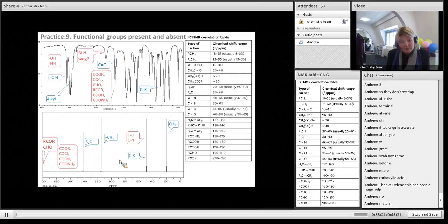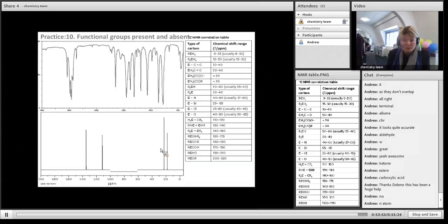In this particular case, actually, and you wouldn't see it without the mass spec, we have a halogen here. So there's actually a halogen in this particular one, which you wouldn't have known very much from the IR. You can see all these peaks here, so you can suspect it. But as I say, the IR fingerprint you use only to confirm. You don't use it to base an assumption on. So you'd get it from the mass spec, and you'd confirm it, that there are CX peaks here.